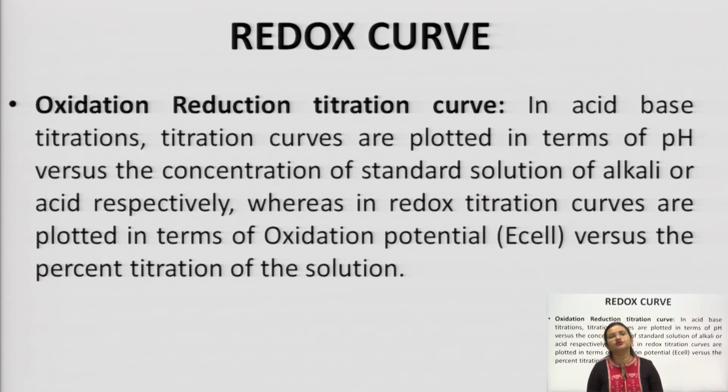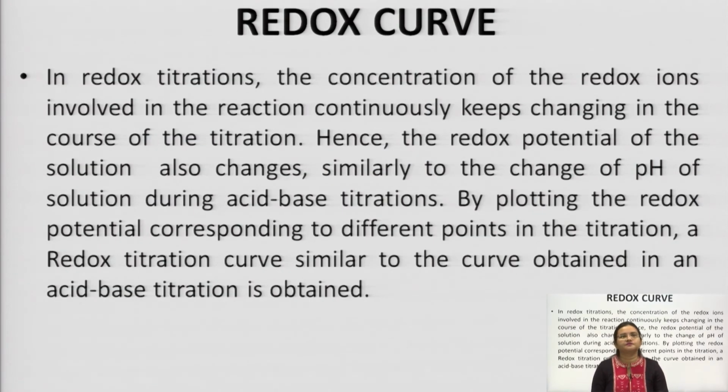कितना titration आपका complete होता जा रहा है, कितना reaction versus the oxidation potential, इन दोनों के बीच में जब आप ग्राफ प्लॉट करते हैं, कर्व प्लॉट करते हैं, then that particular curve is known as redox curve or oxidation reduction curve.